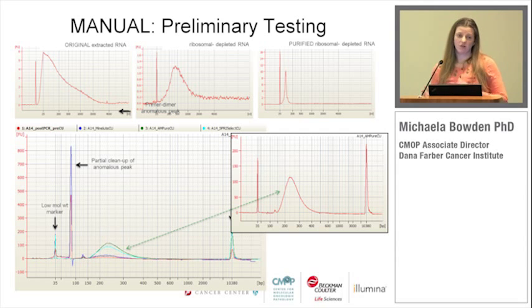And our bioinformatics people can come up with strategies to get rid of it, but you do lose information. And remember, you're already losing information by just having them be degraded. You don't want to lose any more. So this is actually a critical step in what we do.